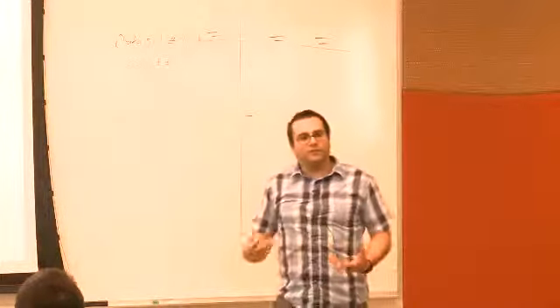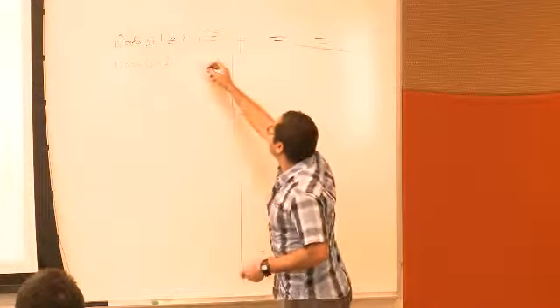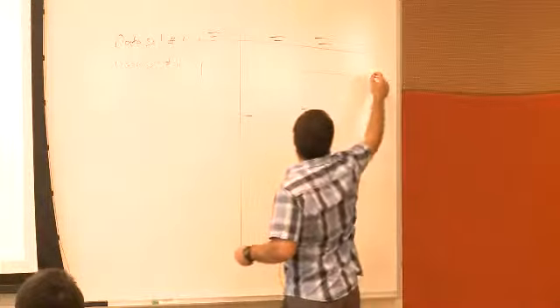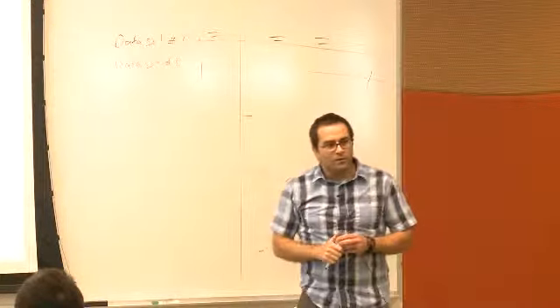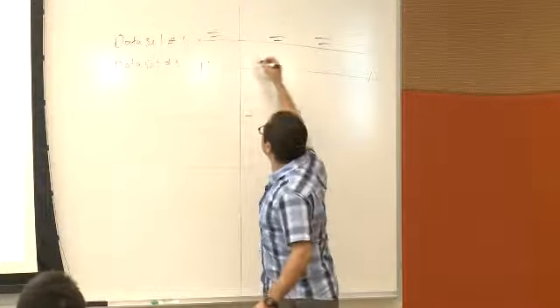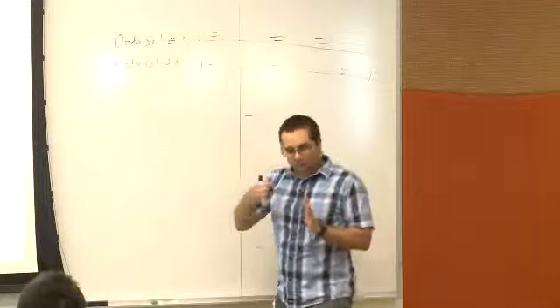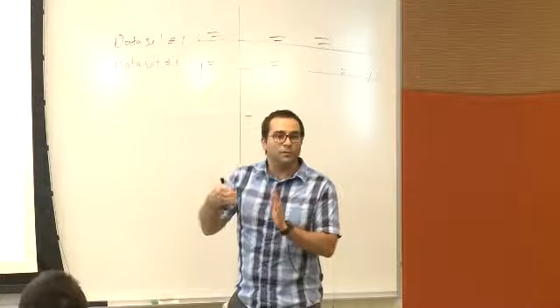Now, when we want to compare between two data sets that have this kind of genome-wide distribution, what we can do is break the genomic area into really small pieces, what we call bins.